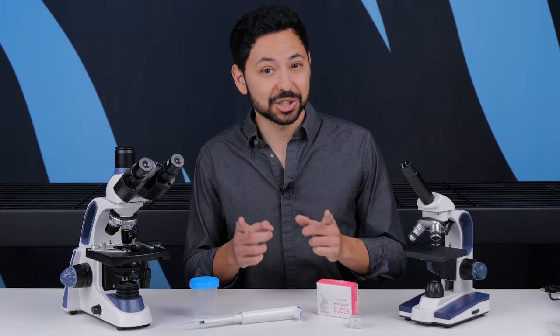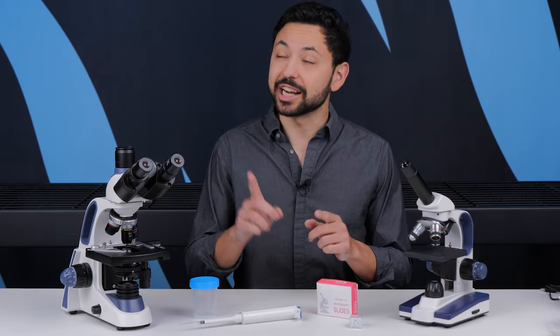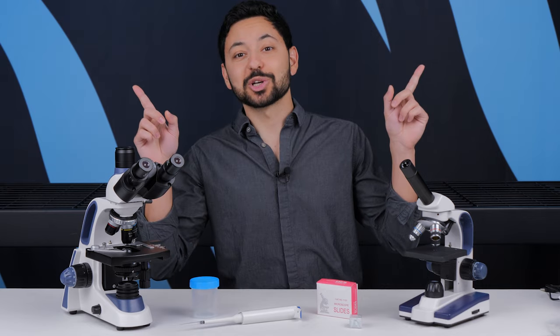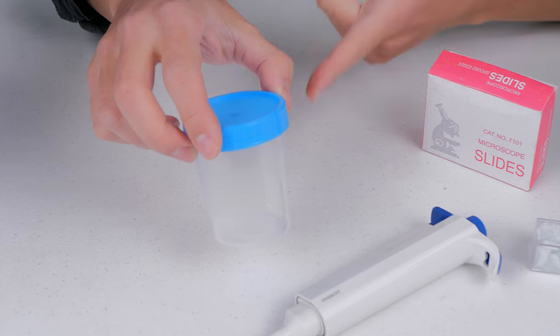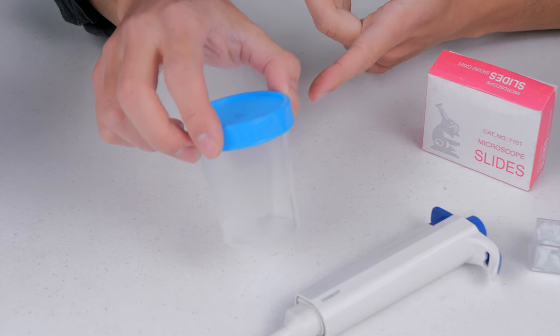Only certain types of microscopes can actually even see sperm. If you haven't checked it out yet, check out my What Microscopes to See Sperm video before this one. First, you're going to start out by collecting your sample in a jar. I'm sure you can figure out how to do this part.